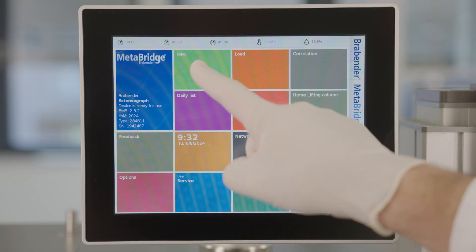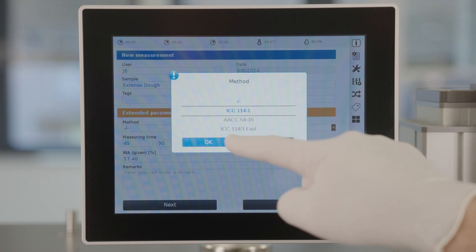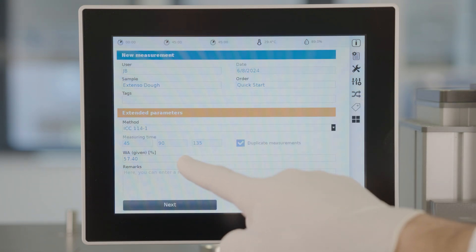Set your test parameters by tapping new and method, and filling the parameters. Tap next or select from daily list.